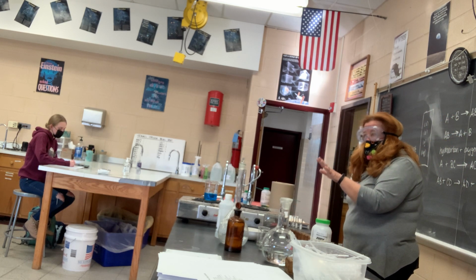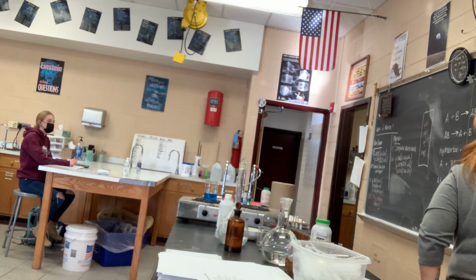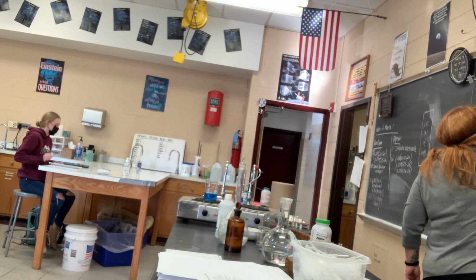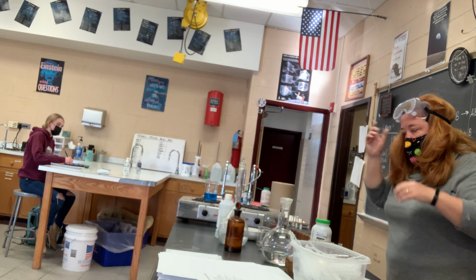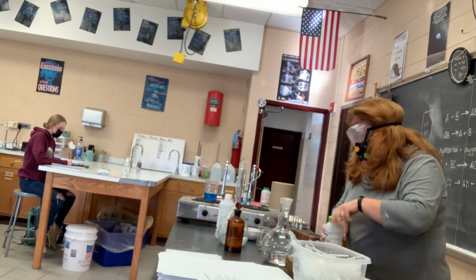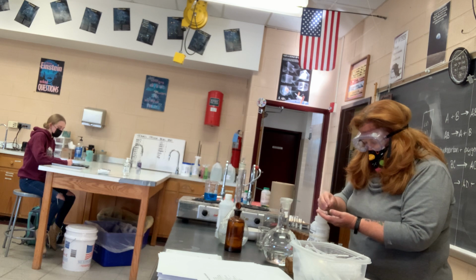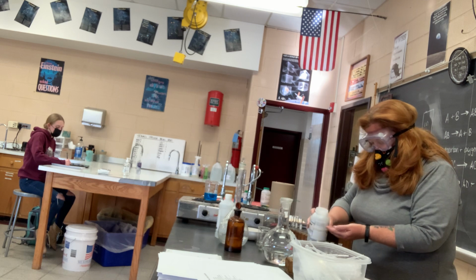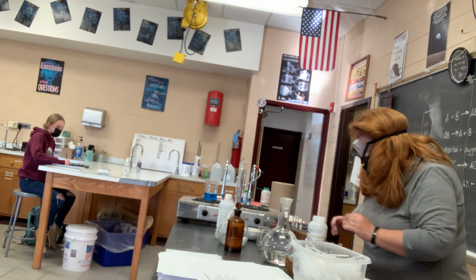That's my fairly warm copper sulfate. I wanna make sure that we have that. So the copper sulfate is a blue liquid. That's copper sulfate. And I'm adding to it zinc. And the zinc is still silver, not very shiny. This is a single replacement. Trying to get smaller pieces so it'll happen faster. This one takes a while.